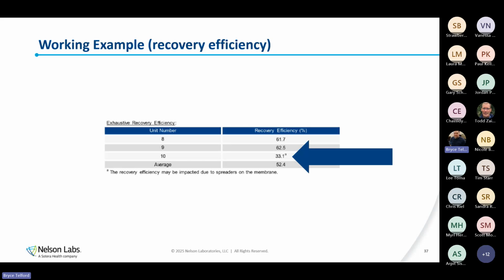And with that additional testing, maybe taking action in order to minimize our spreading, perhaps something such as an agar overlay in order to try and trap those microorganisms. But most certainly probably along the lines of gathering additional data points so that I have an additional set of statistical data to base my consistency off. Yes, Scott.